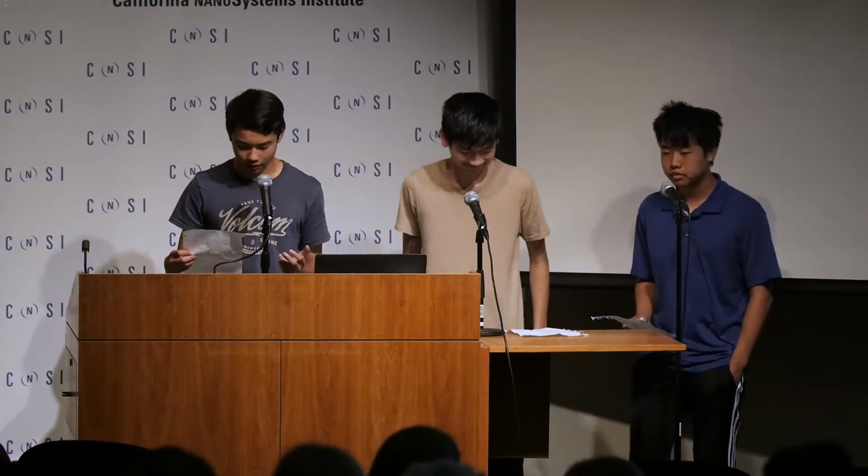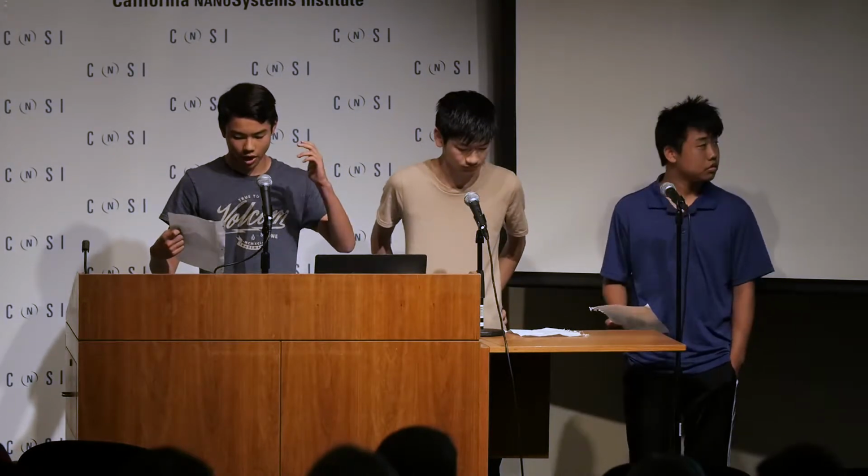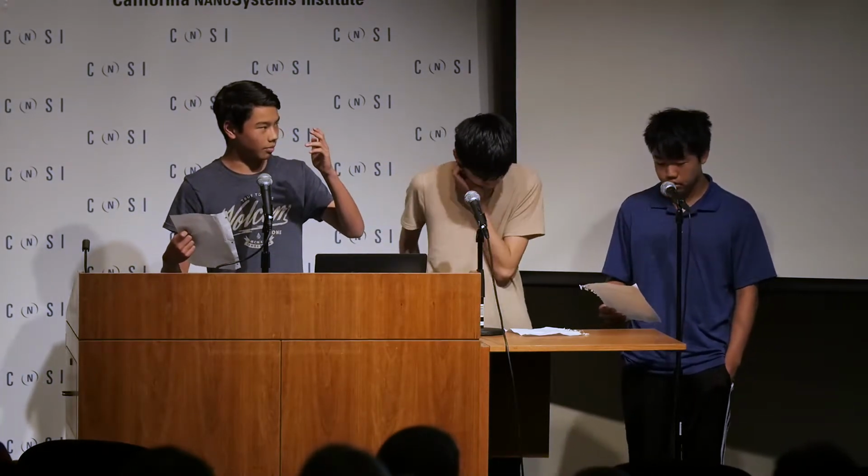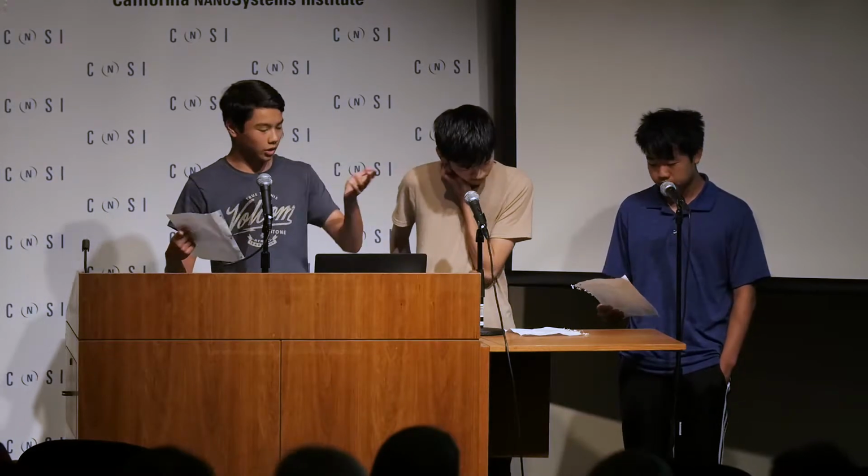So in this experiment, we tested the effectiveness of 4 different ways of, or at least attempts to kill cells. So we used yeast cells, and we determined whether or not they were killed by using a manometer to measure how much carbon dioxide was being produced. So obviously, if there are cells, due to cellular respiration, more carbon dioxide will be produced. But if whatever we put in killed the cells, then less carbon dioxide would be produced.